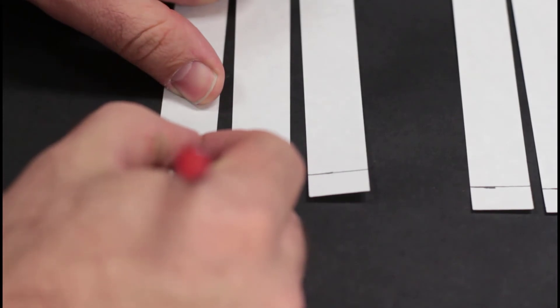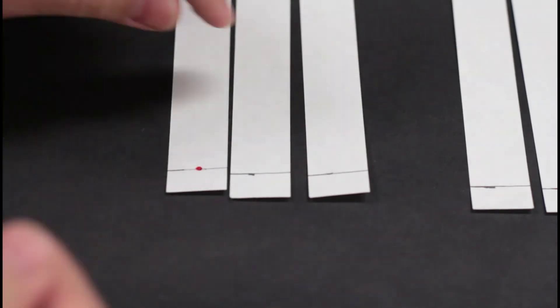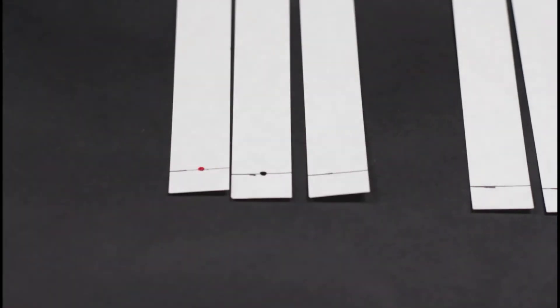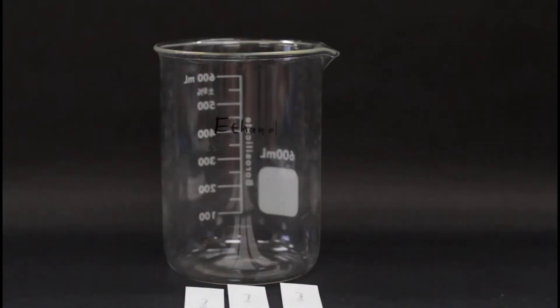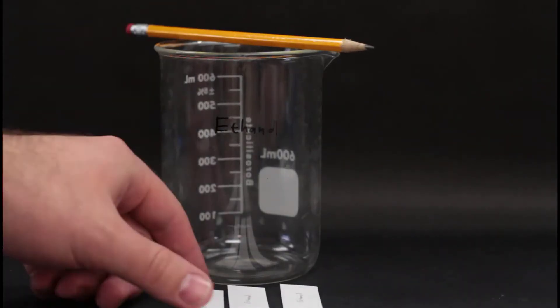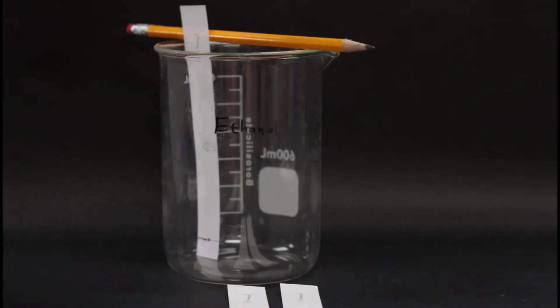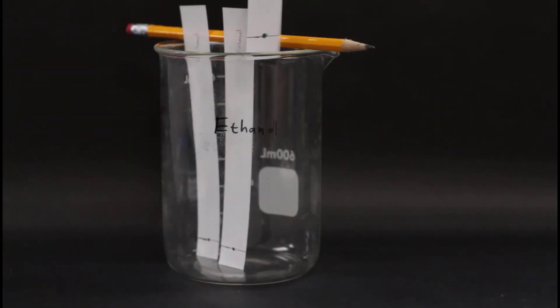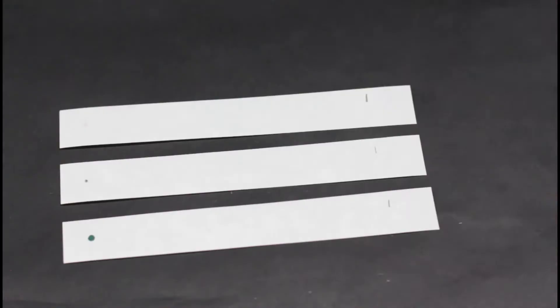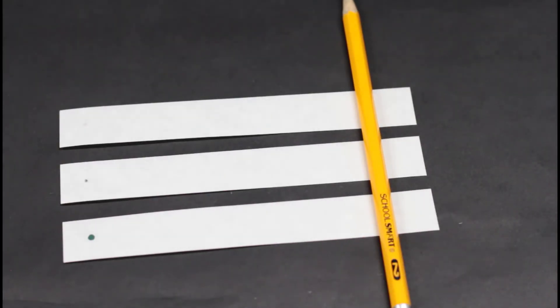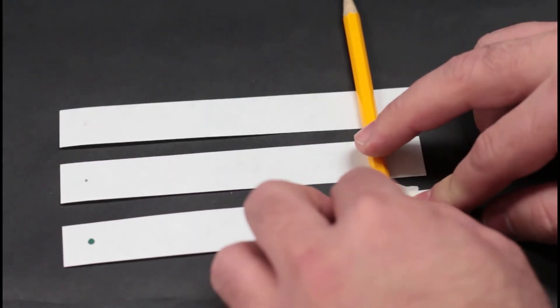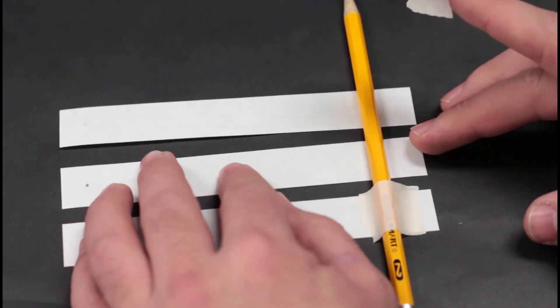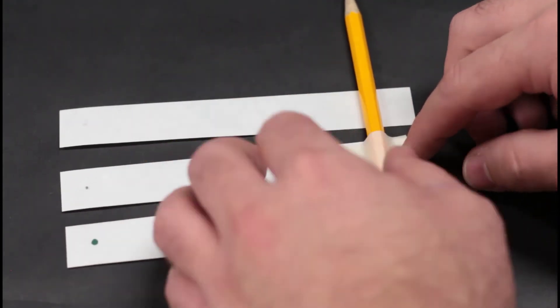Put a dot of ink on each chromatography paper in the center of the line that you drew. Set the paper in an empty beaker with a pencil across it so you can figure out where you need to tape the paper to the pencil so that it's just barely above the bottom of the beaker. We want it just barely touching that bottom so that it'll just be in a small pool of solvent.